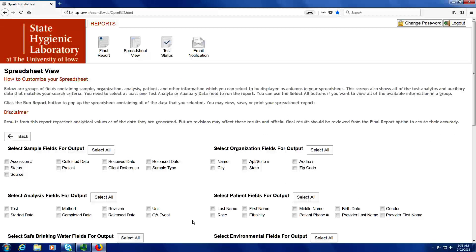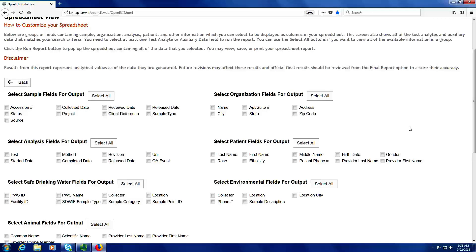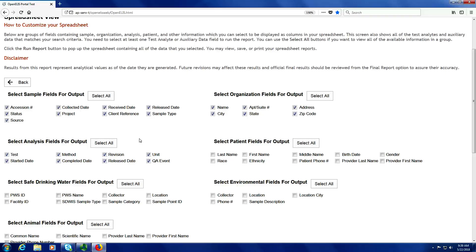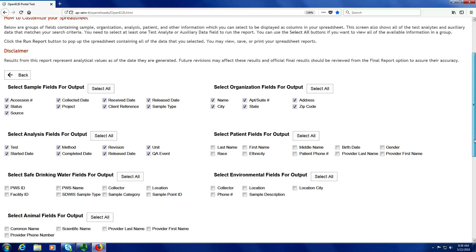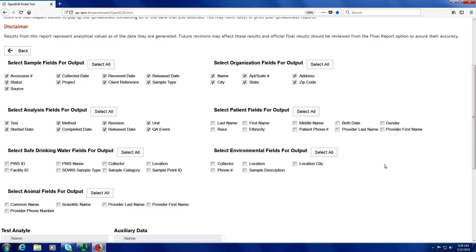This next page has a listing of all the fields that I can output into my spreadsheet. I can choose what columns I want by selecting those individual fields, or I can use the Select All buttons to select all the fields in that grouping. I am going to click Select All for the sample fields, organization fields, and analysis fields. These fields are present for all types of samples, whether they be environmental, safe drinking water, or clinical. The next groups of fields are only available for certain types of samples, but since I have samples from each type, I am going to go ahead and click the Select All button for each of these groups.